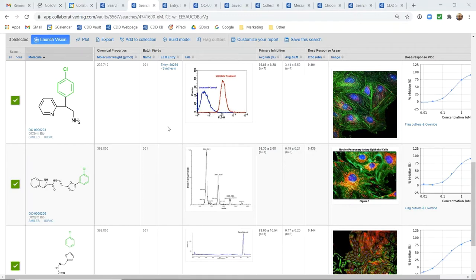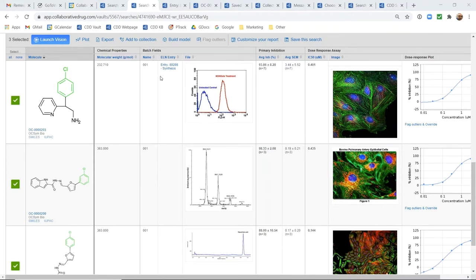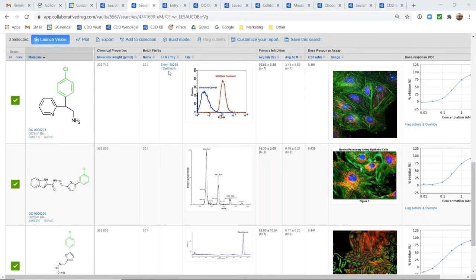Whenever a batch of a compound or an entity is registered or linked to from an ELN entry, you automatically get this link. So this means that this batch of this molecule was registered from an ELN entry.